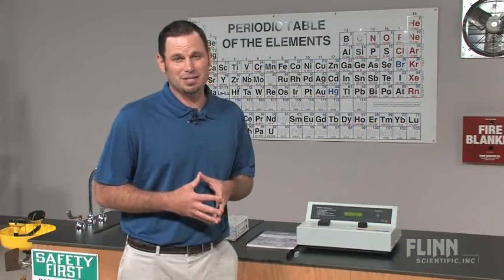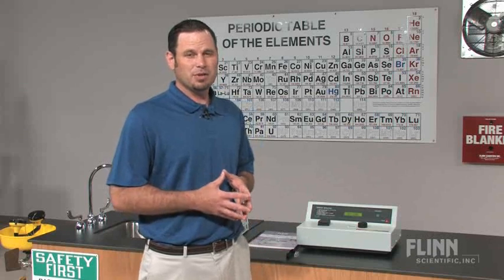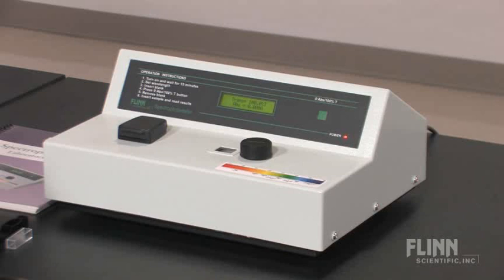I want to introduce you to the easy to use and economical Flinn Scientific spectrophotometer. This unit features a one-button simple operation. It has 0% absorbance and 100% T all together at once.